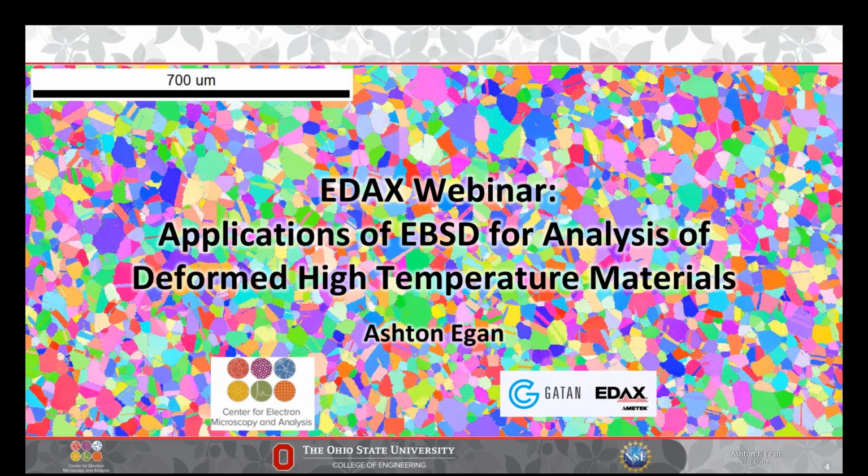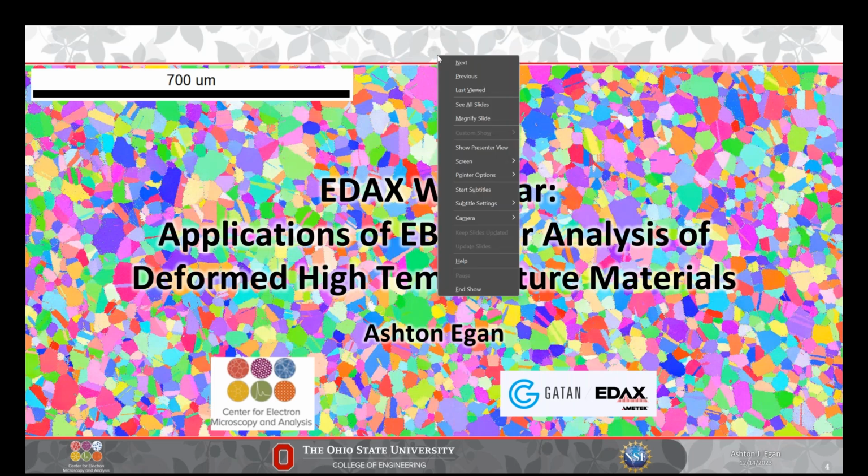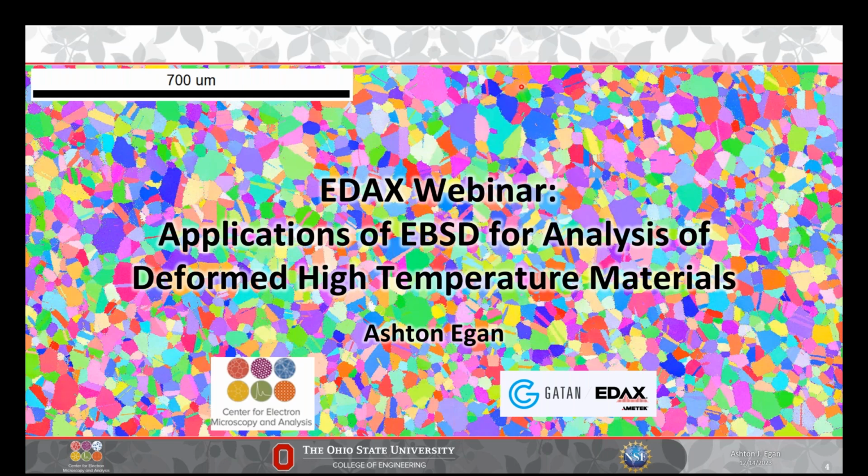Hi, everybody. Thanks for coming to my talk, and thank you very much for the nice introduction. So today I'll be talking about some applications of EBSD for analysis of the alloys I work on, which are deformed high-temperature superalloys mainly, but I also talk about titanium in the back end of this.